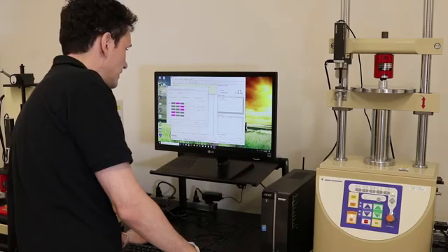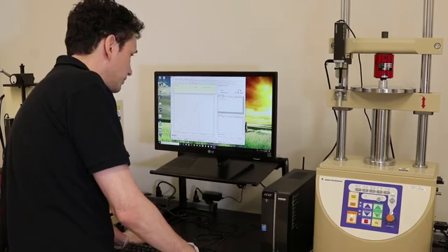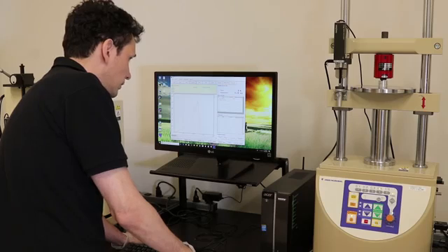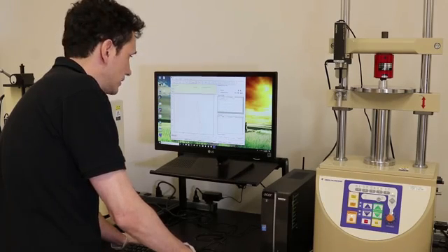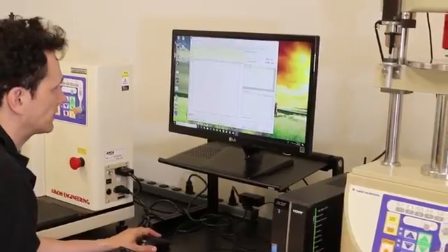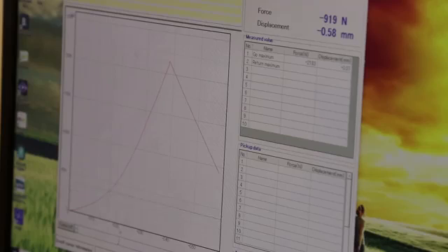So we give the customers basically a stress strain curve at a specific speed, and then we'll actually wait 1 minute, and then you get this force here at 1 minute. So basically, it gives you the dynamic forces that you're dealing with, and then the pseudo-static load you're going to see. I call it pseudo because it actually does change a little bit over time.